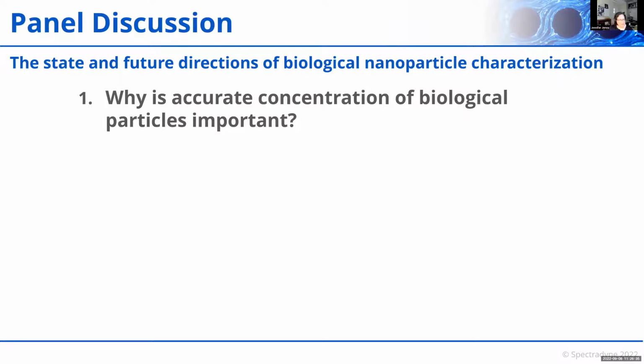And you've helpfully emphasized in this how you're able to establish the limit of detection. So when we report measurements like this, where you can assess a limit of detection on a calibrated scale, then you can report truly accurately in this range. This is what we see. So that's really helpful to add that accuracy.